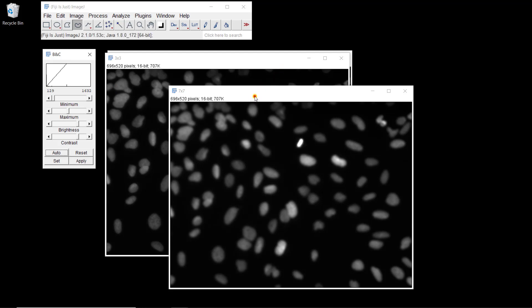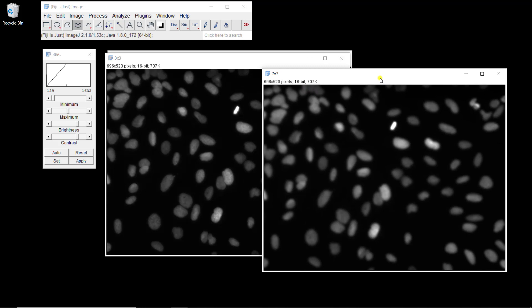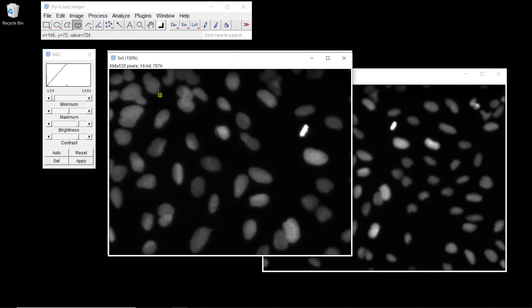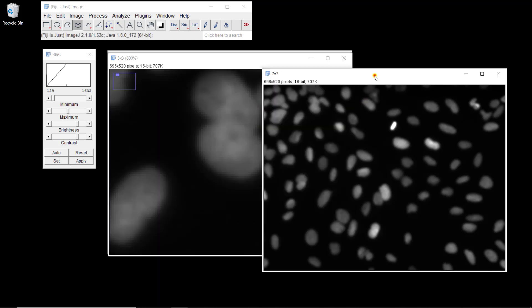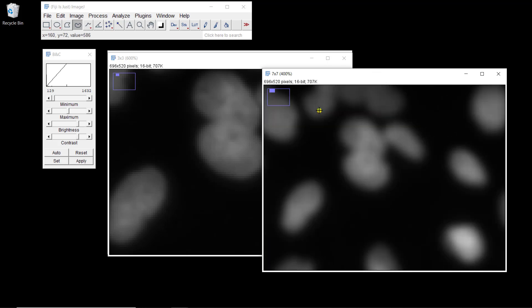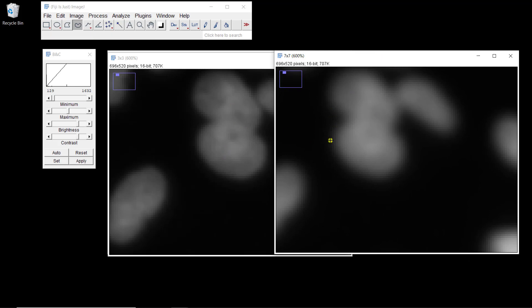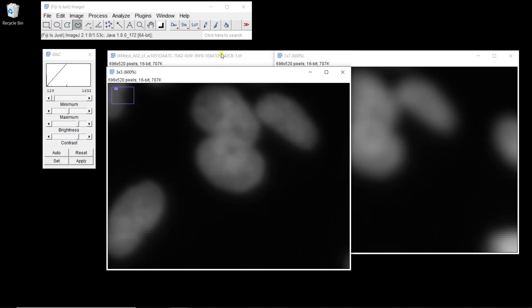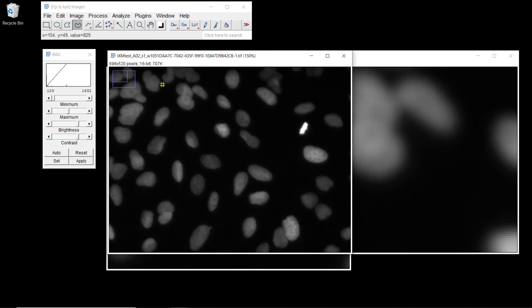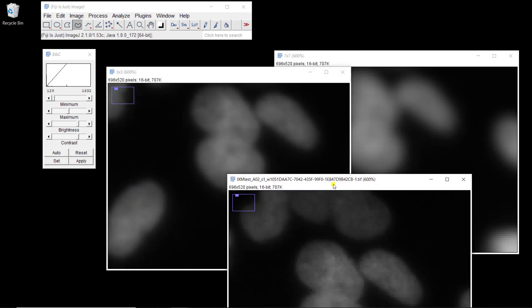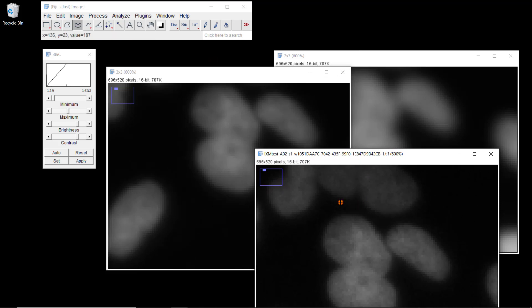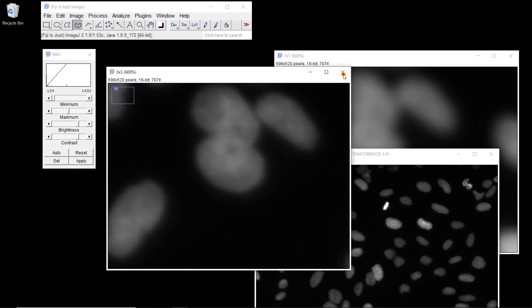It's not a surprise — that's what you'd expect. If the kernels have a larger size, you're going to blur even more, because you take the average of intensity in a local neighborhood that is larger, which involves more blurring. As you can see, with the 7 by 7 kernel the nuclei are almost uniform, while with the 3 by 3 you see more differences inside the nucleus. Looking at the original image in the same region, you can see it's much less uniform. So that's expected.